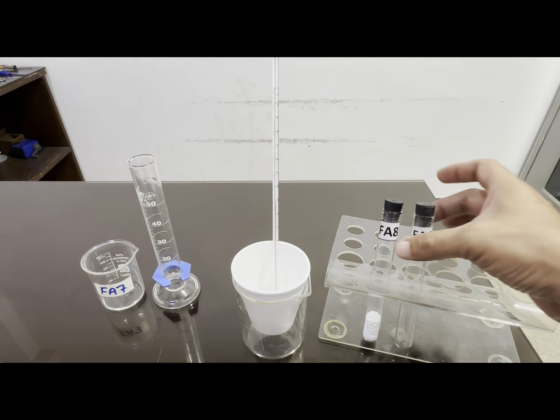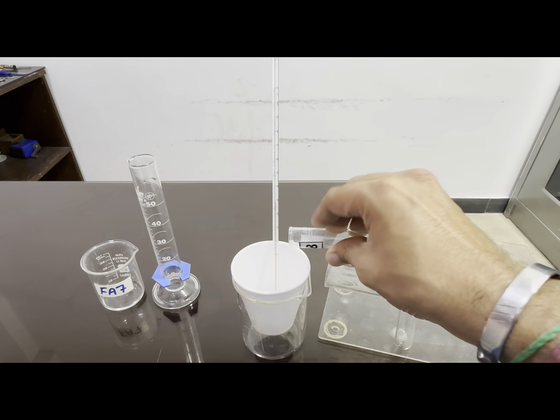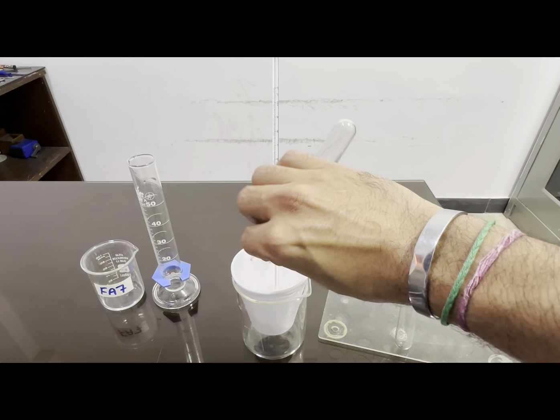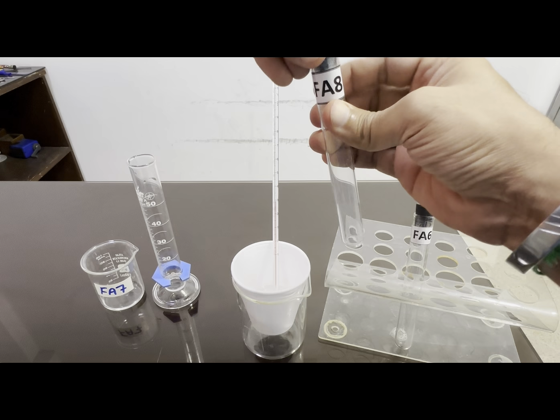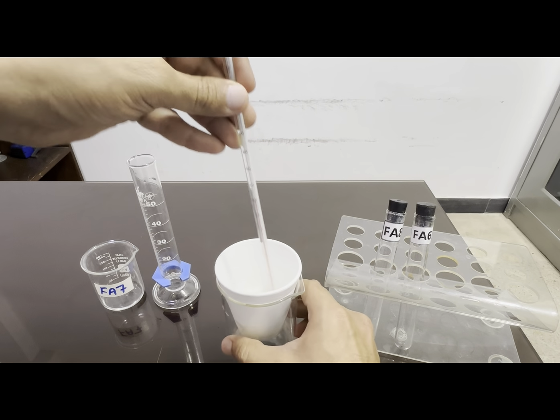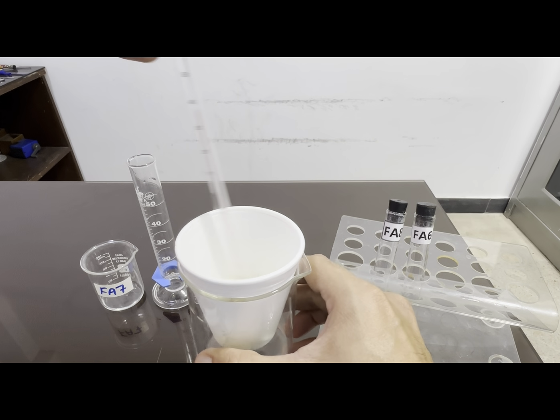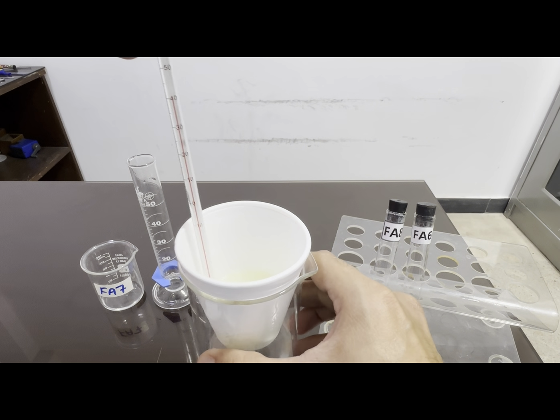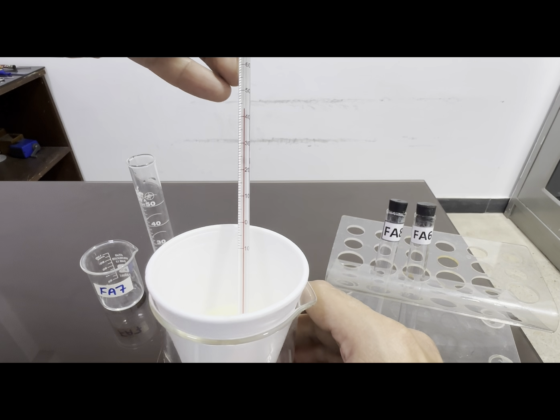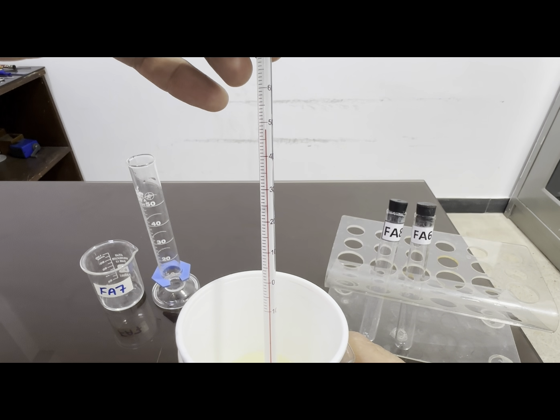Now let's tip all the Fa8 into this plastic cup and stir to record the maximum temperature. Temperature is rising rapidly, you can see.